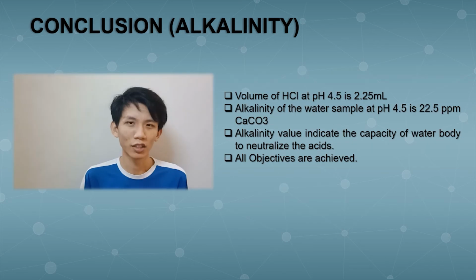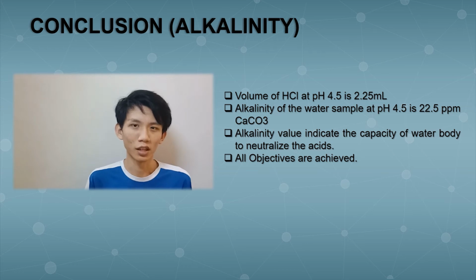In conclusion, alkalinity indicates the ability of the water body to neutralize the acid. So for the experiment, the alkalinity of the water sample is 22.5 ppm calcium carbonate. So all the objectives are achieved.